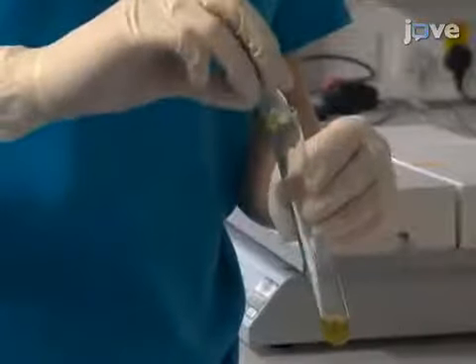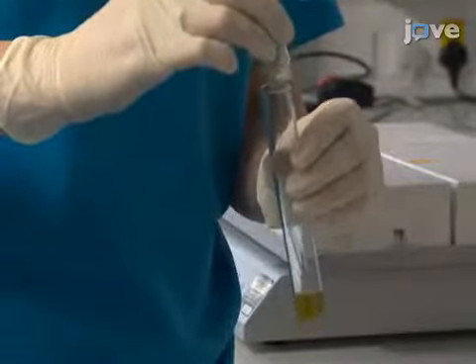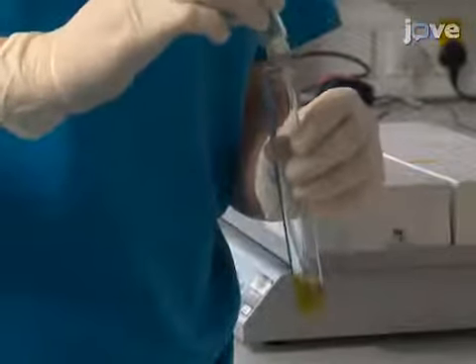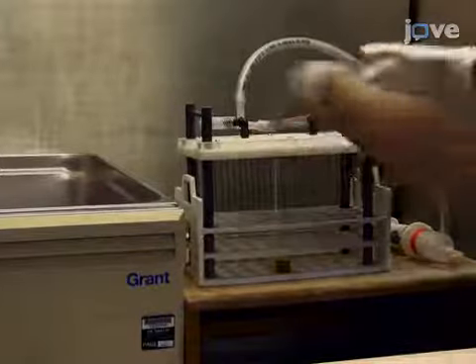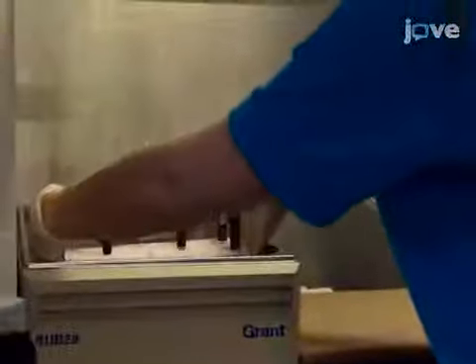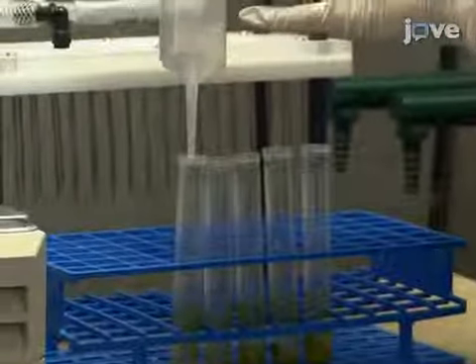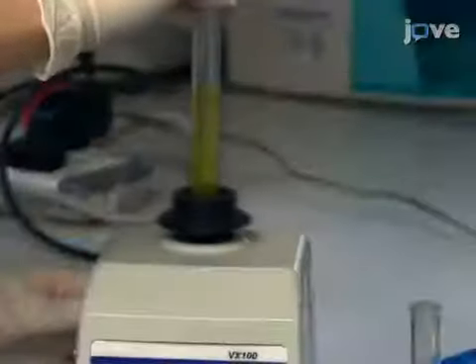At the end of the centrifugation, decant the methanol fractions into individual 16 by 125 mm glass tubes. Then briefly place the tubes in a 37°C water bath, followed by evaporation of the methanol under air in a fume cupboard. When all of the methanol has dispersed, resuspend the fecal extracts in 1 ml of 100% methanol.